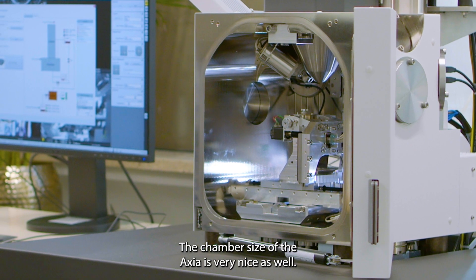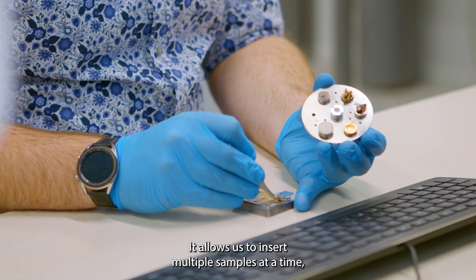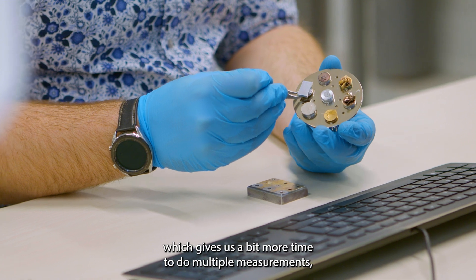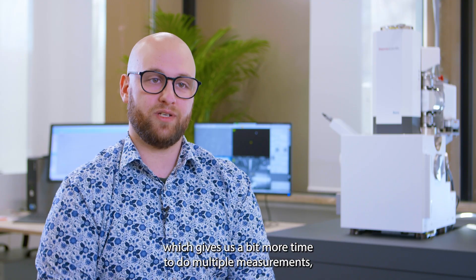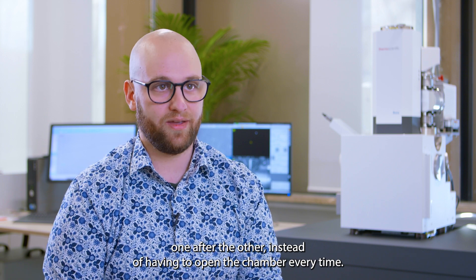The chamber size of the Axia is very nice as well. It allows us to insert multiple samples at a time, which gives us more time to do multiple measurements one after the other instead of having to open the chamber every time.